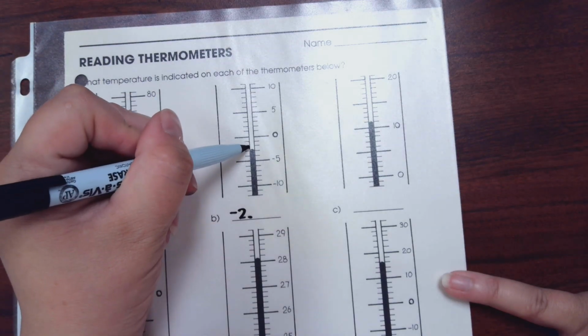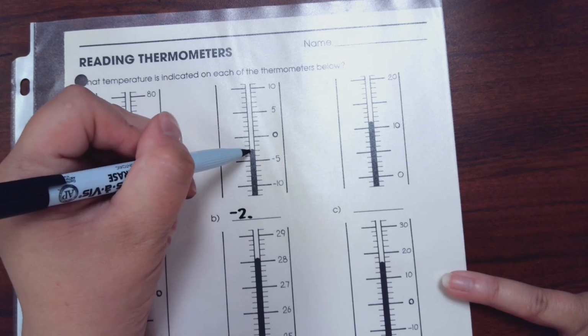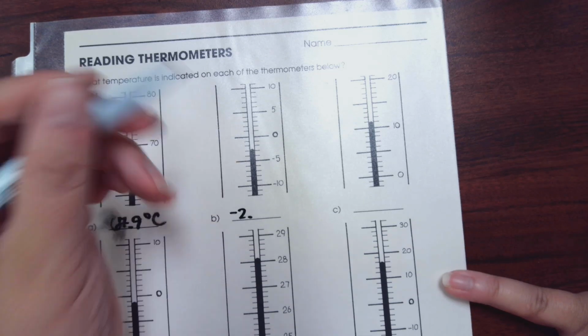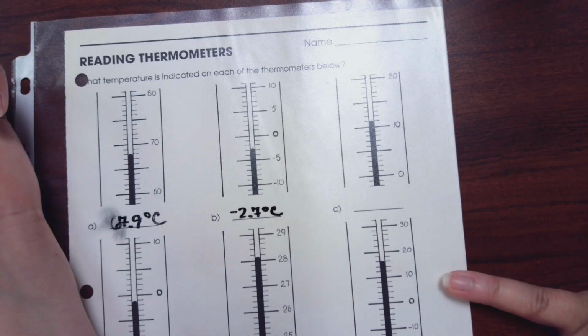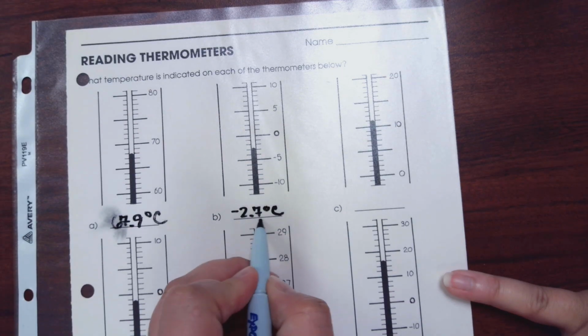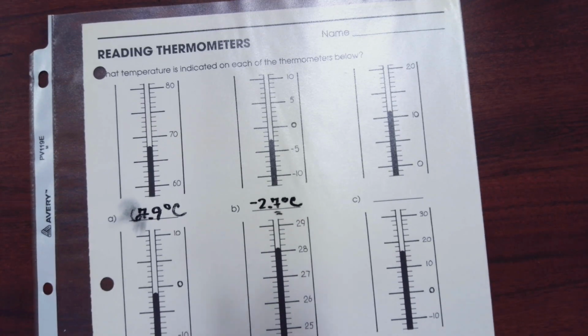Now I'm going to estimate, and be careful because remember, this is going kind of weird. It's backwards. So 2 is here, 3 is there. So we're kind of almost to the 3, but not quite. I would call that -2.7. Some people might call it -2.8. Some people might even call it -2.9. Again, that last digit is estimated. All right? So you're going to have a few of these that you're going to want to practice.